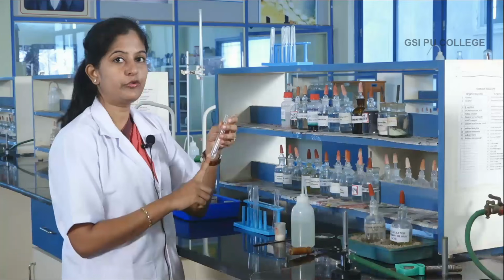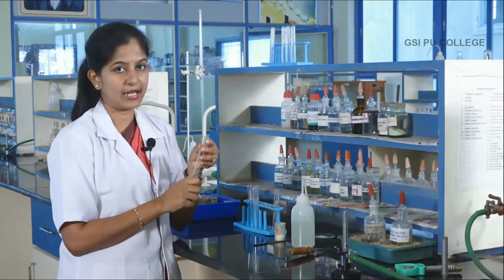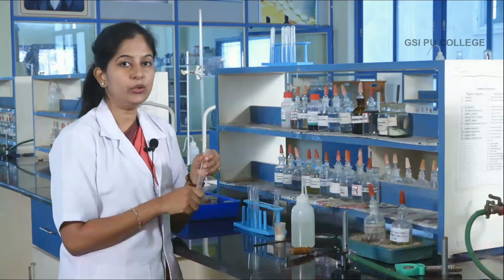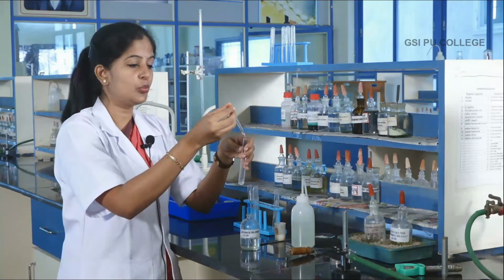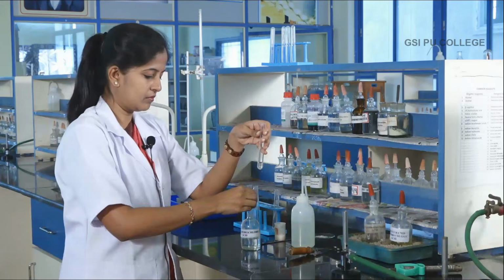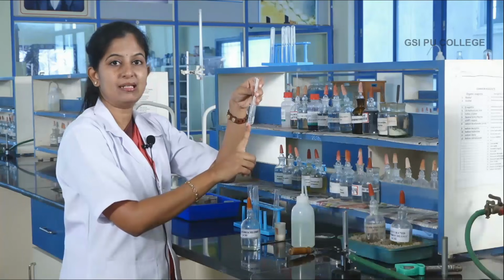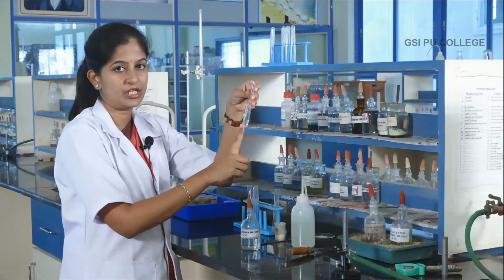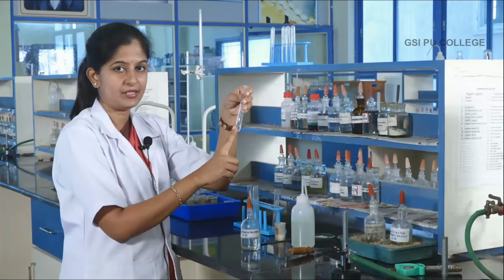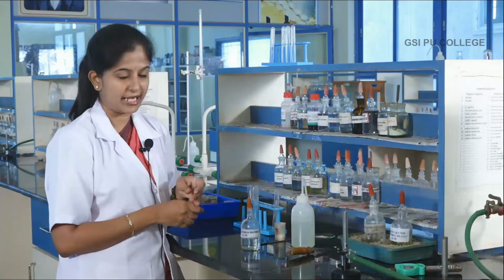Take a small amount of original solution, add the group reagent for the first group basic radical. So, what is the group reagent for the first group basic radical? It is dilute HCl. So, add dilute HCl. You can observe a clear solution, which means that there is no precipitation, which means that the first group basic radical is absent. So, we have to move on to the second group basic radical.